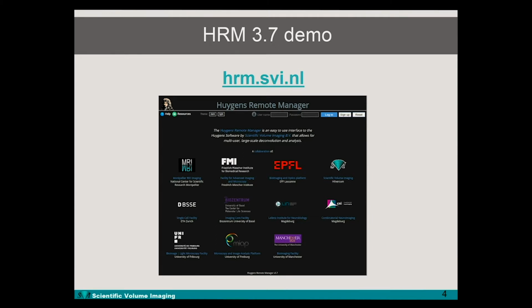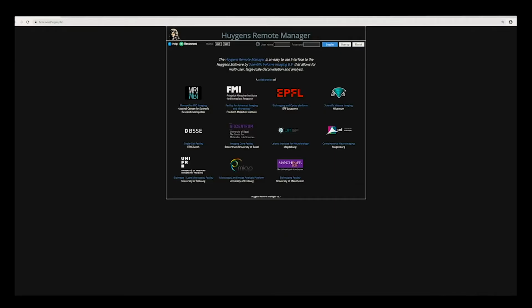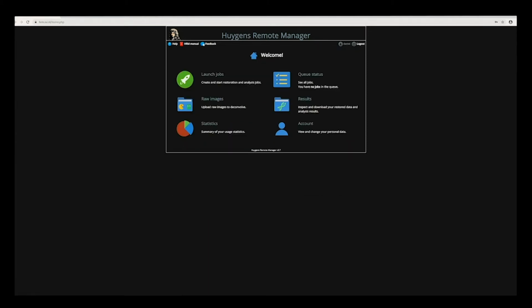So I will open a browser and point it to this address, hrm.svi.nl. And as I said, if you want to use it for testing purposes, just sign up here. For the rest of the presentation, I will log in with my credentials and show you what you can do with this latest version.